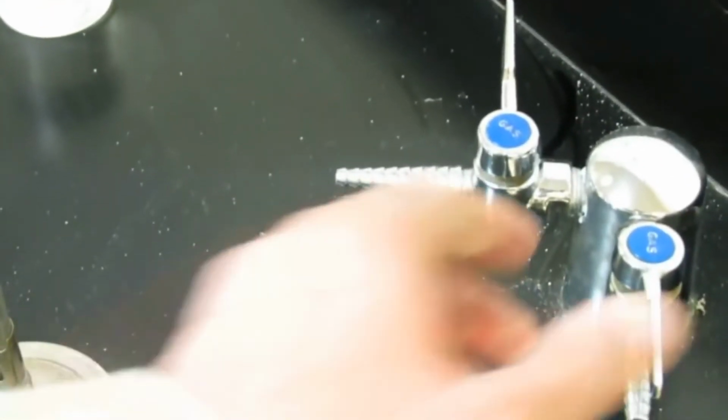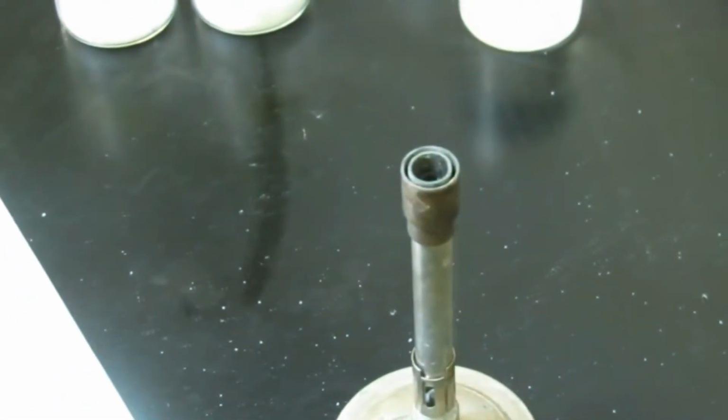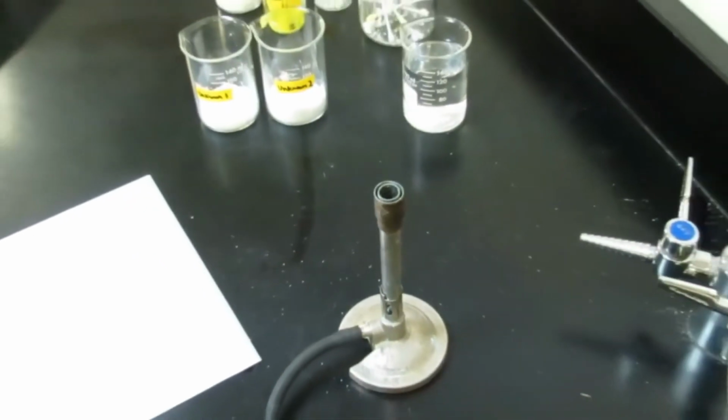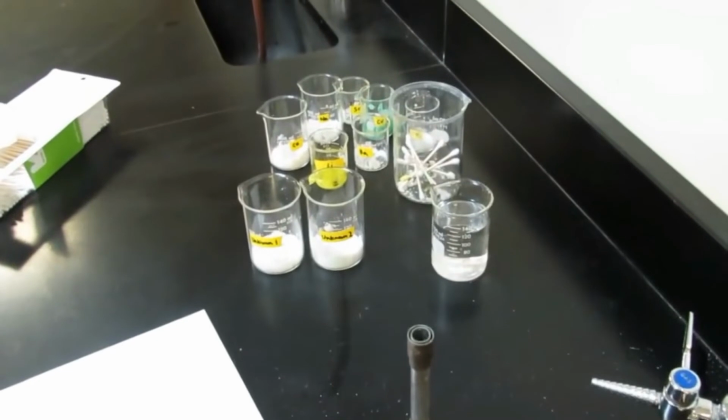To shut the burner off, remember, we'll just go ahead and turn that gas valve over. You guys can return your safety glasses to the safety glass cabinet. Make sure they're put away neatly so that they can be sanitized properly for our next class.